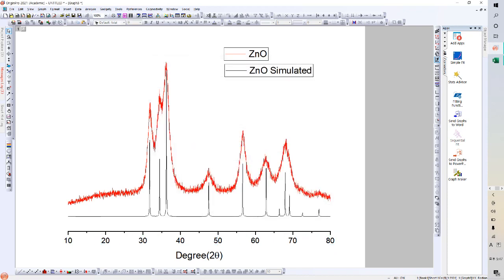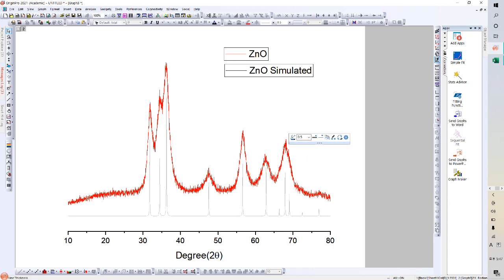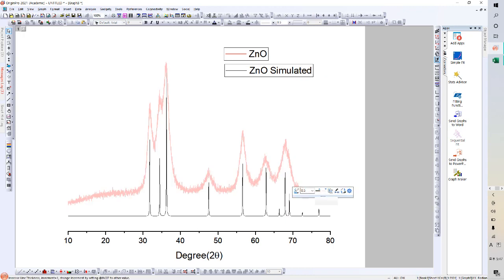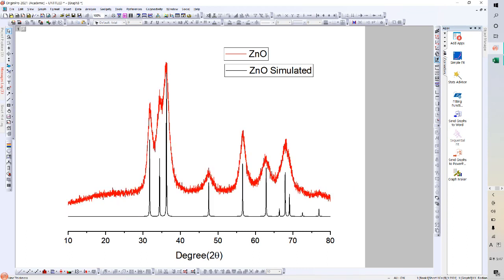And it's okay to make the graph like this, but if you want it to be a bit clearer, you can always choose to change the thickness of the graph. If you click 1, it will be even thicker, and if you choose 1 for this, you can left click and change it to 1. They will both be more clear. And you can either leave it like this or change it.